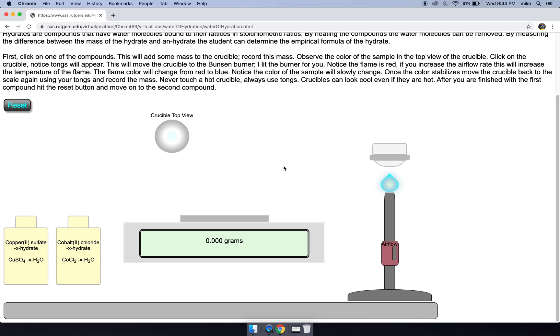Sometimes you have to do this a few times in lab to make sure the mass isn't fluctuating anymore, but by our color appearance it doesn't seem to be changing.